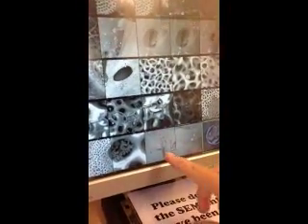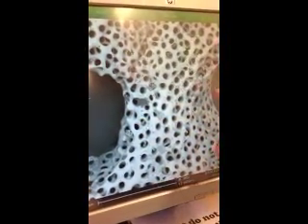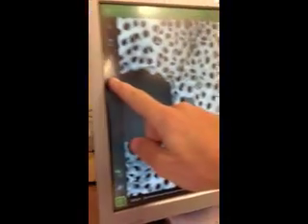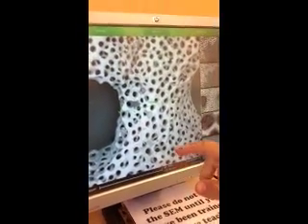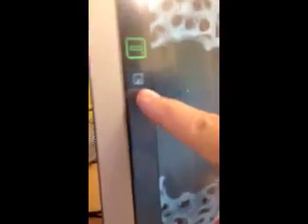So if you want to measure any of your photos, go into archive. There's a bunch of photos here already. Click on the photo that you want to measure — this one looks great. So I want to measure from this hole to that hole, so I use this ruler button. I click on the left side, and then I'm going to touch on the right side. And that looks like it's about 290 micrometers. I have to save whatever I do, so I click save, and that's going to save a new image.